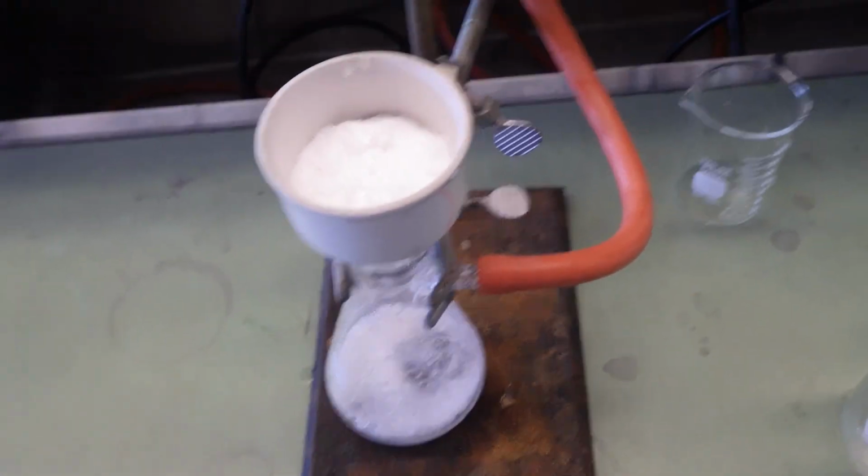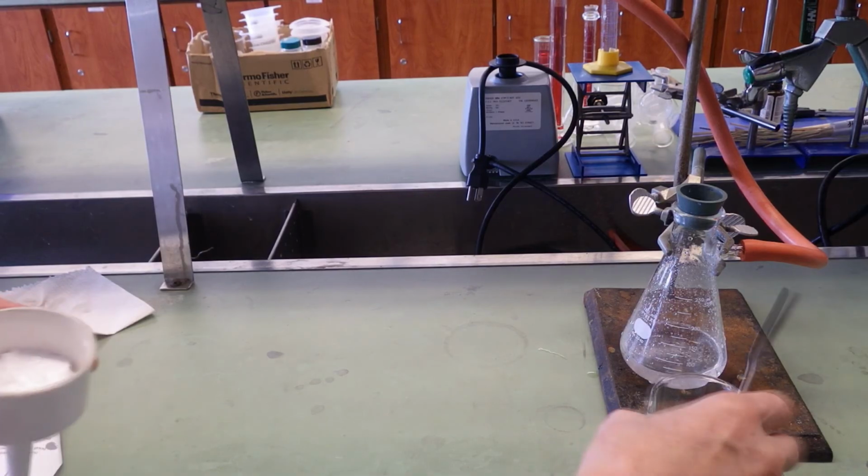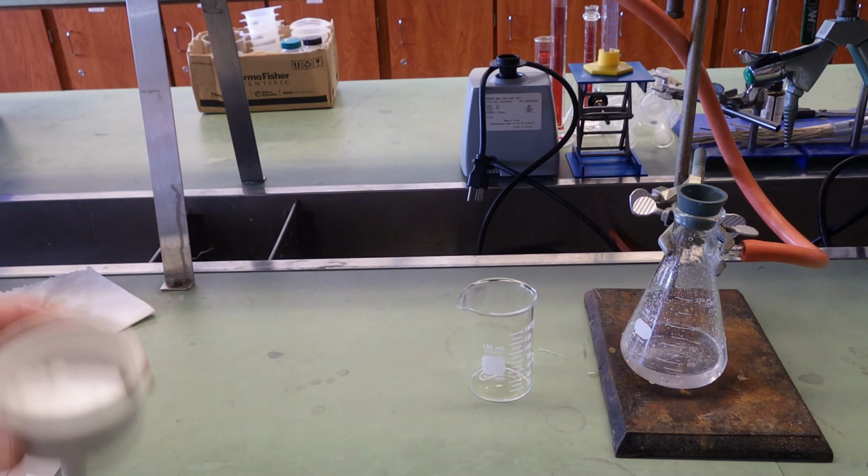So here's the final filtration and wash. And finally we'll transfer our pure solid and filter paper into the pre-weighed beaker. We'll need to let it dry overnight before we can get the final mass.